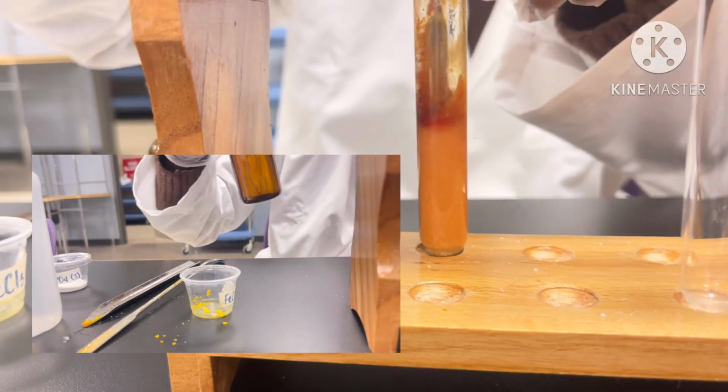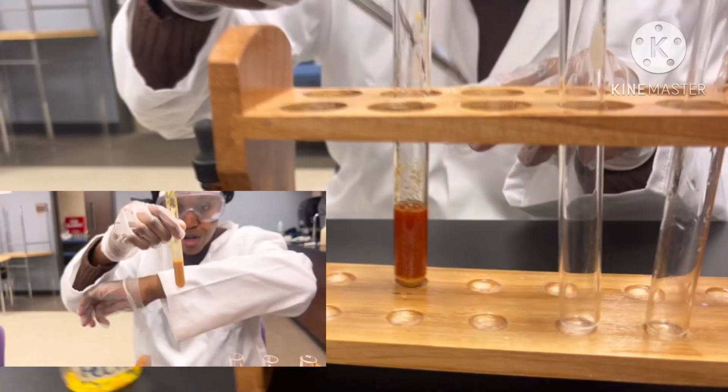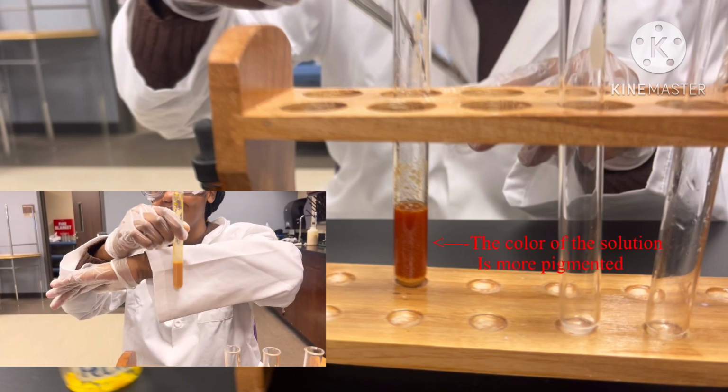To produce more product, I am adding potassium thiocyanate to further the shift of the equilibrium to the right. Due to the increase in the concentration of the product, the pigment of the color red darkened from what it originally was before when we added the iron 3 chloride.